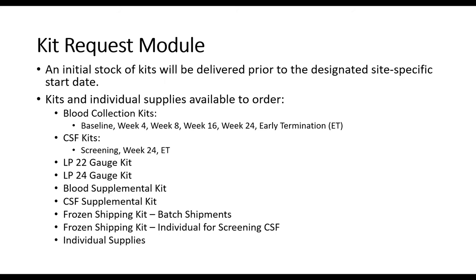Then there's 2 different kinds of frozen shipping kits for this project. There are batch shippers, which are for the majority of the visits. And then there's the individual shippers for that screening CSF visit, because those do need to come to NICRAD promptly after they are collected so they can be used for enrollment criteria. Then if you need individual supplies, those can also be requested on there as well. We do ask that in advance of you starting your study that you please request initial stock of kits so we can make sure that those can be delivered to you before your start date.